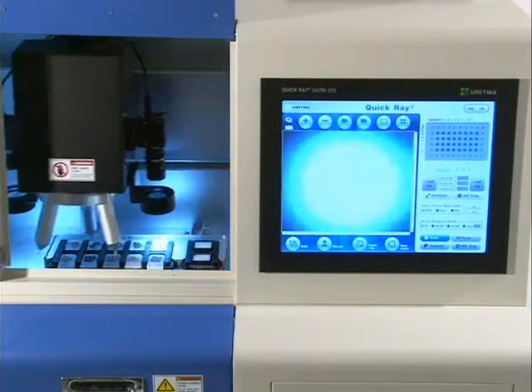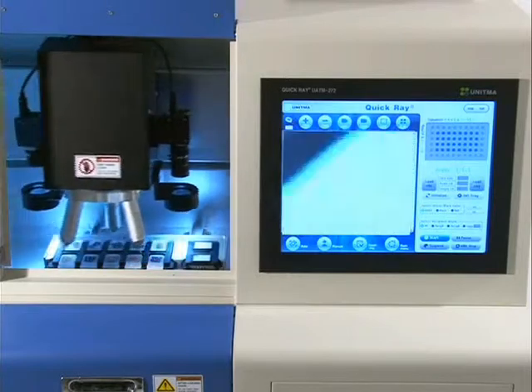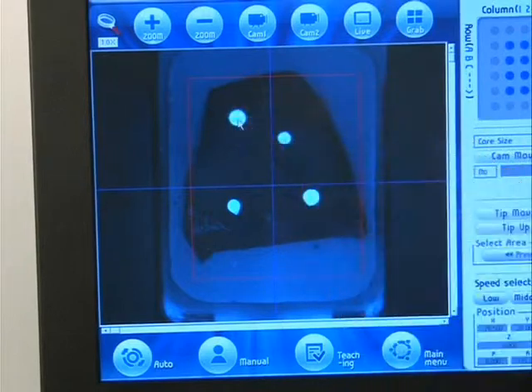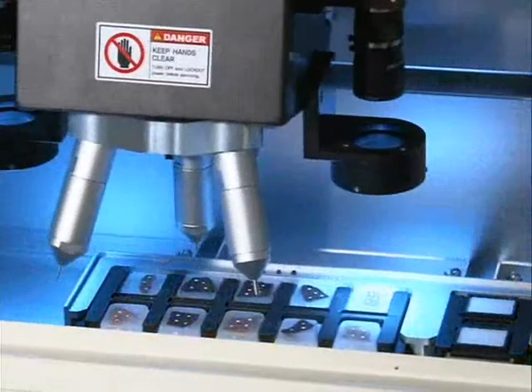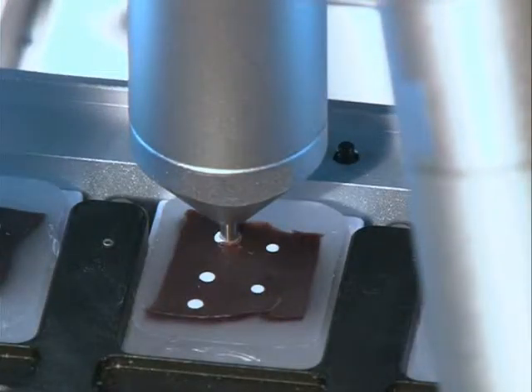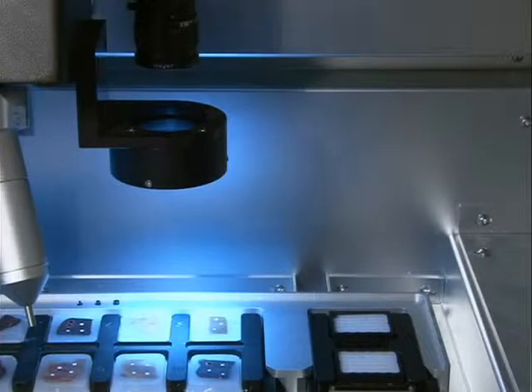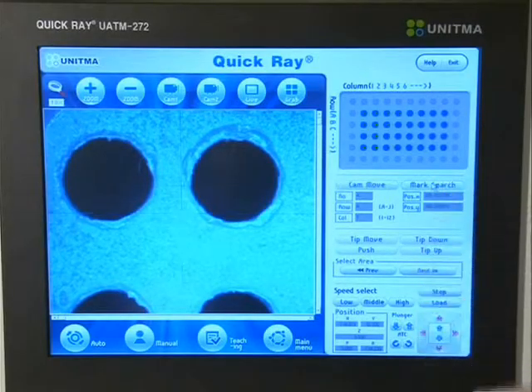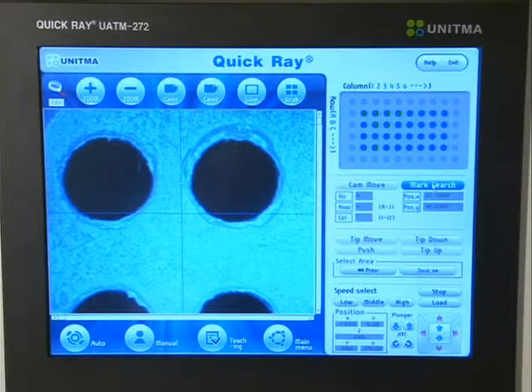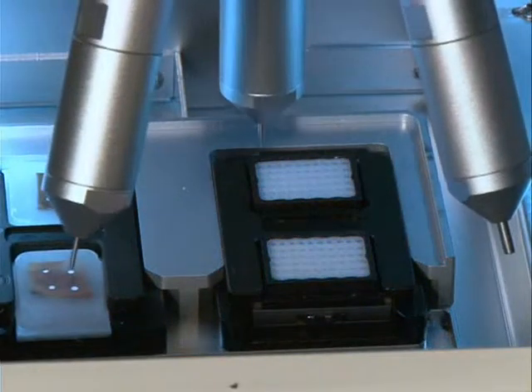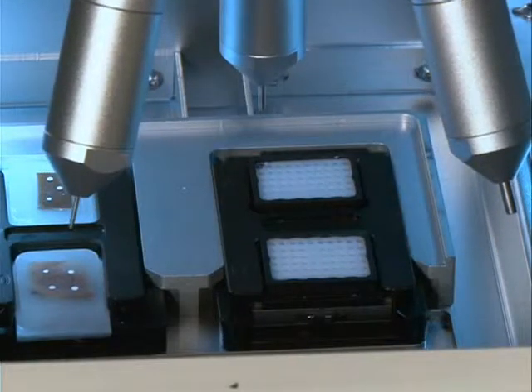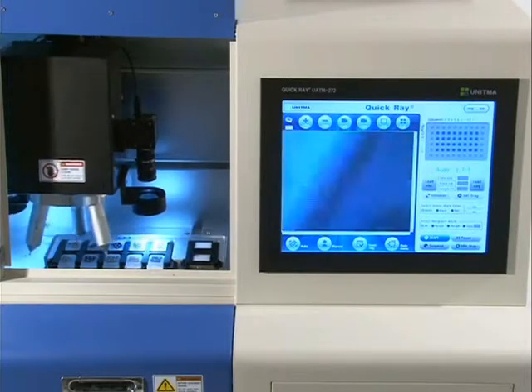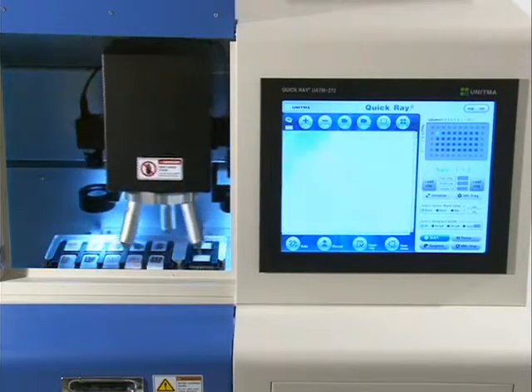The procedure for Unitma automated tissue microarrayer's extraction and insertion of a tissue sample is as follows. The camera for donor blocks automatically recognizes an area marked by an oil pen on a donor block to extract a tissue sample. Then the camera moves to a recipient block where the tissue sample will be placed. The camera for recipient blocks automatically recognizes the center of the hole to compensate the coordinates and insert the tissue sample. With the cameras, a tissue sample is recognized and the position of the hole where the sample will be placed is identified, so that very accurate work can be done without tolerance.